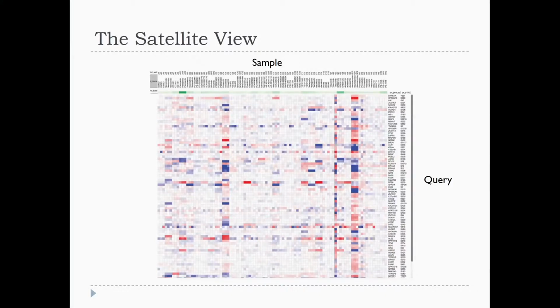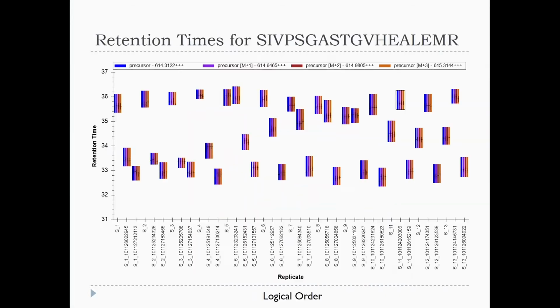And people do stop here, and I think that stopping here and sort of viewing the tool as just this set of steps that I have to go through and then I get this, that's the most likely reason you don't get over that mountain bioinformatics that Rudy showed on the first day.